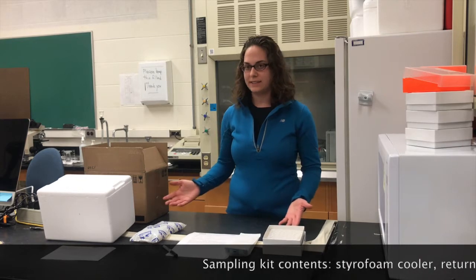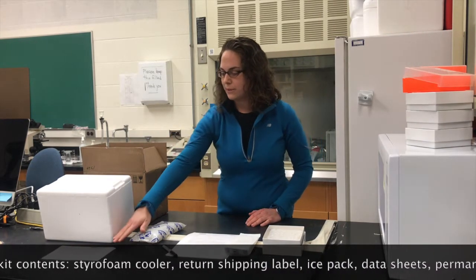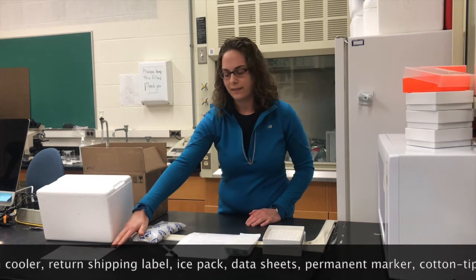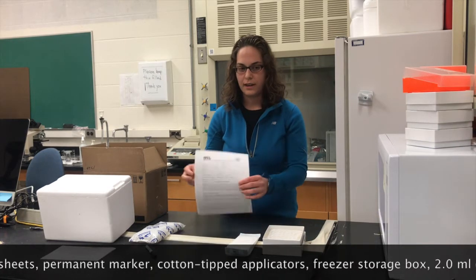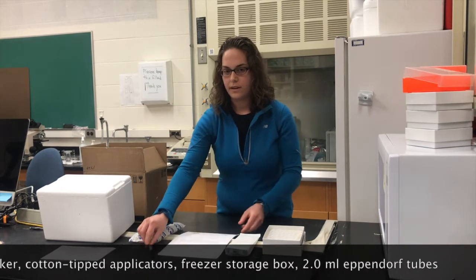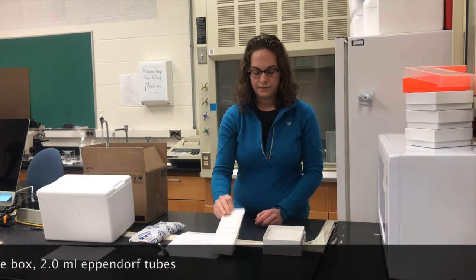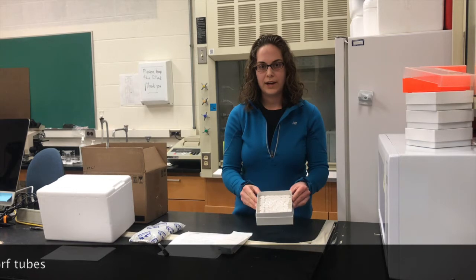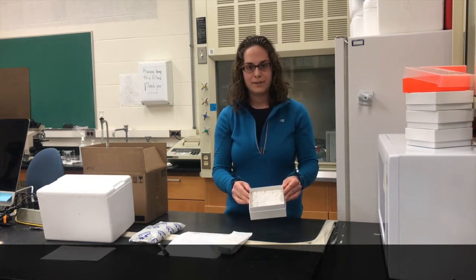Hi, I'm Ellen Haynes, a veterinarian and PhD student at the Wildlife Epidemiology Lab. You will be provided with a sampling kit that contains all of these items: a styrofoam cooler and a box for shipping, a pre-labeled shipping label to mail your samples back to our lab, and a cold ice pack. You will also receive a few copies of the data sheet, a permanent marker, cotton tip applicators for swabbing snakes, and a storage box with 2 milliliter Eppendorf tubes, some of which will be pre-labeled so you can see how the tubes are to be labeled.